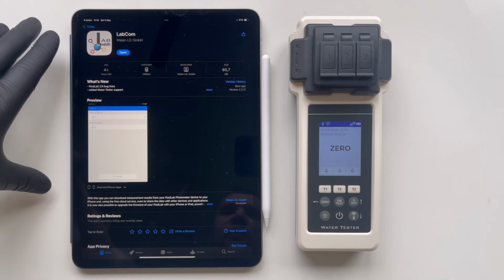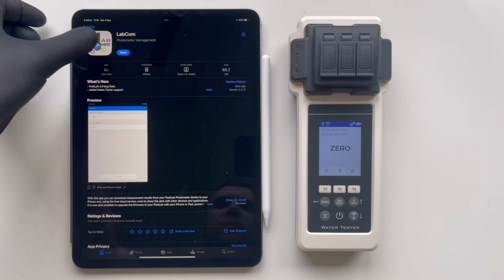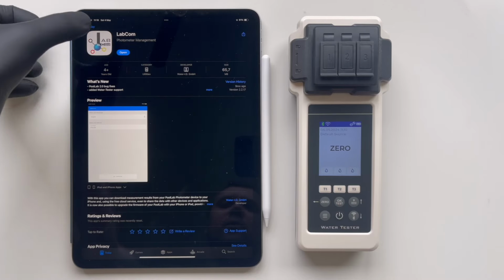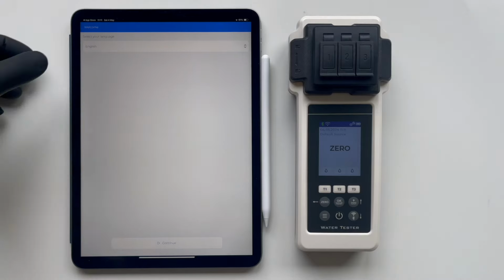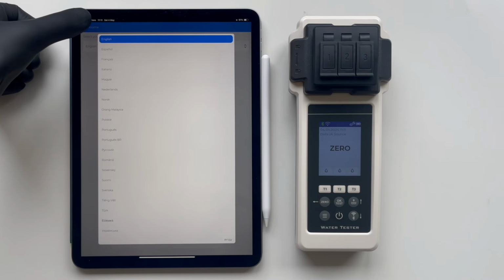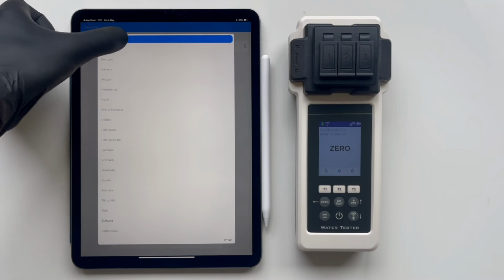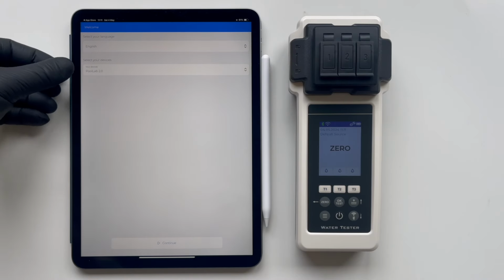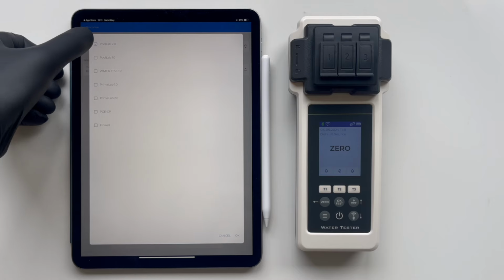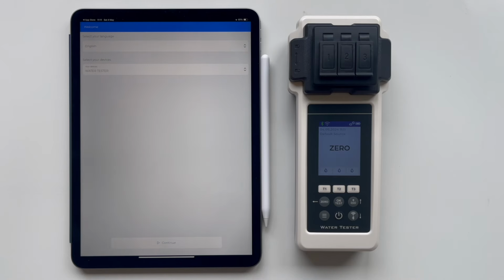There, we navigate to the LabCom app in the App Store. Once found, we proceed to install it by clicking the Install button. This action initiates the download and installation process directly onto your device. After the installation is complete, you can open the app. At this stage, you need to select the language you will use in the app. We press Continue. Now, we need to select the device we're using. In this case, it's the water tester. We press OK to confirm our selection and proceed.